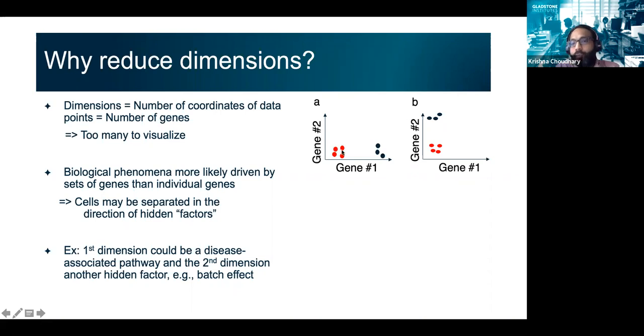Let's say in our sample we have 2 kinds of cells, disease cells and healthy cells, and that is what we have experimented with. Let's say these cells are distinguished by the expression of one gene, gene 1, the gene associated with the disease.